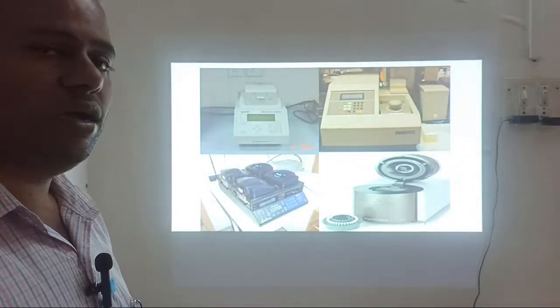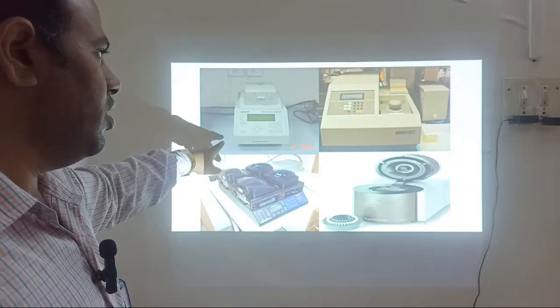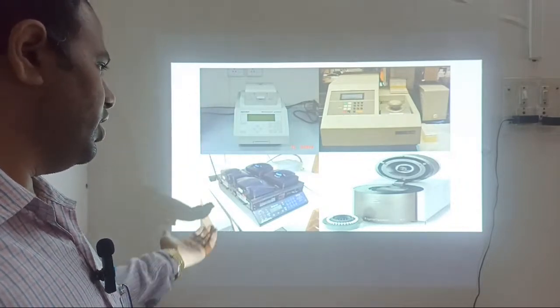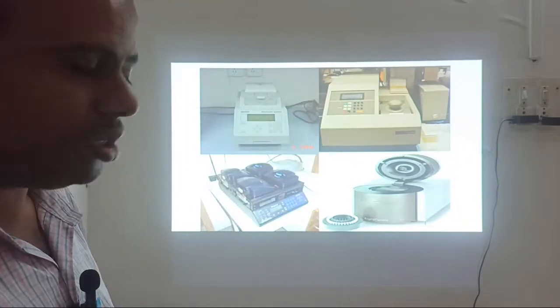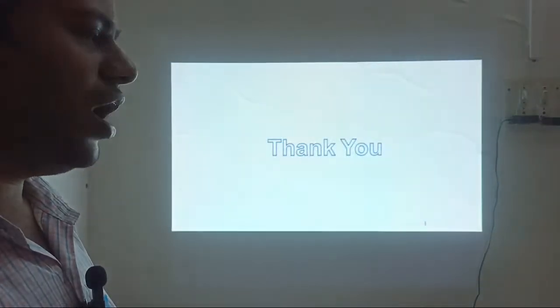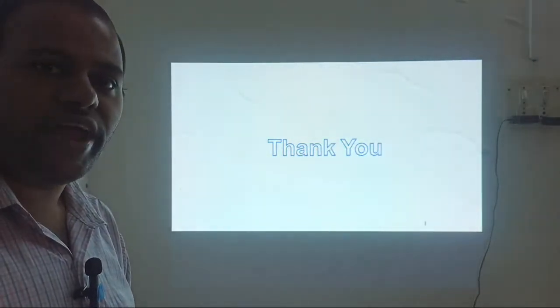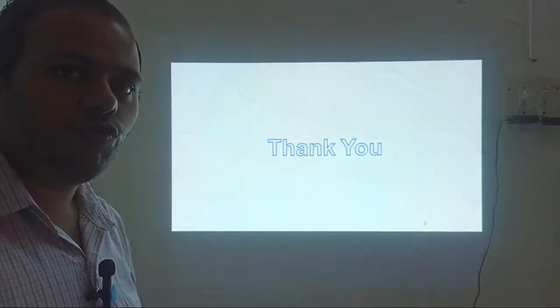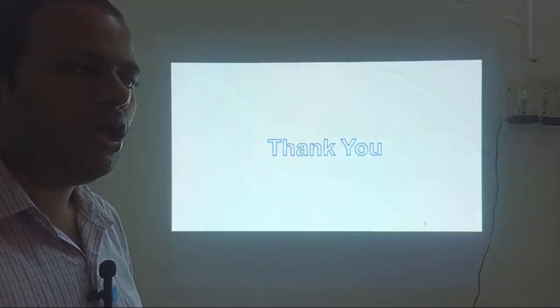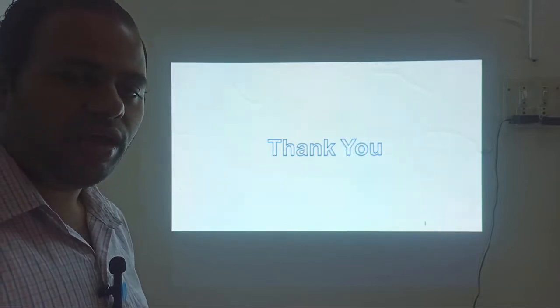You can see I am showing you another PCR. This is the basic PCR, that is a thermocycler. Then these are a few other examples also. Today in this lecture I told you about different polymerase chain reactions and thermocyclers and their types. I have shown you certain images of thermocyclers also. I hope you have understood the whole mechanism of PCR and thermocycler.